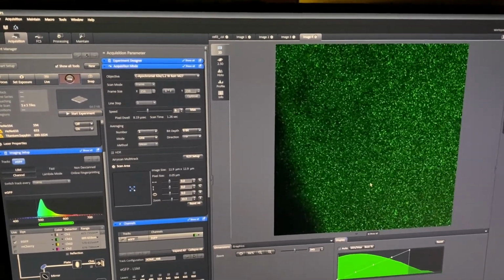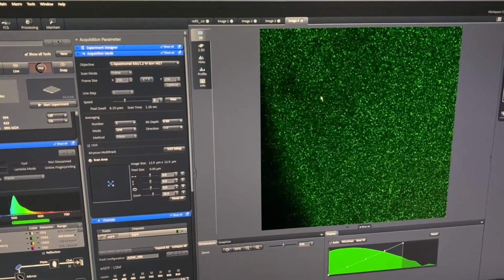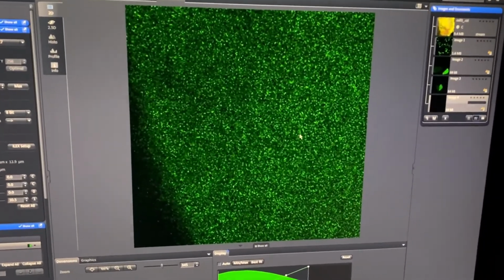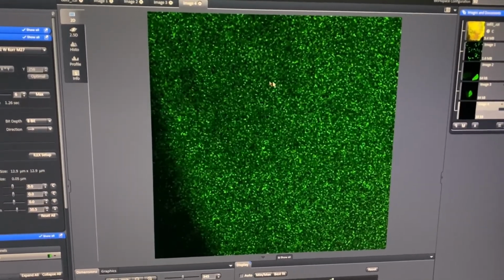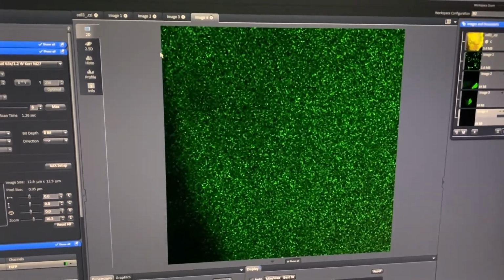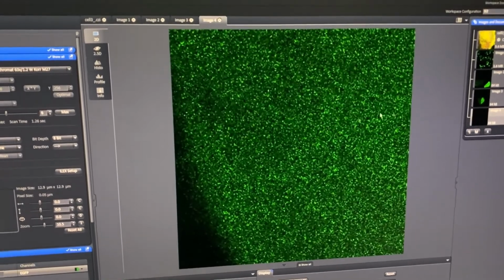So how you know that this image, or this cell, can be correlated is, if you look very closely, you see horizontal lines moving, and you also see this line scanning. What this line scanning means is that it's a raster scanning. Raster scanning basically moves from the left side of the pixel to the right side, and then back to the next line to the left, and then goes again. So this kind of zigzag pattern of scanning is called raster scanning, which is what is happening here.